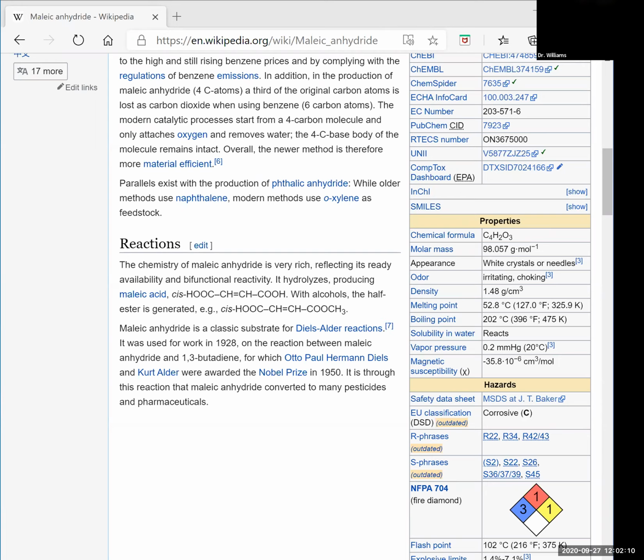So to do this, I'm going to set a temperature 4 degrees below this to begin heating. So somewhere 47.2, I think that'll work. 47.2 is where I will start heating the sample, and I will finish heating the sample about 4 degrees beyond the 52.8. So somewhere in the area of 56.8 degrees. So that's going to be the range over which we heat the sample.